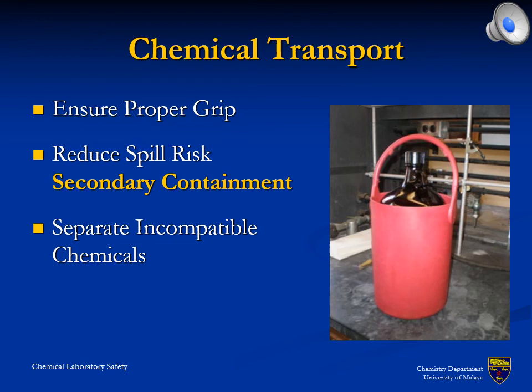Transport of chemicals requires the use of carriers with secondary containment. While chemicals may be combined for transport, separate carriers have to be used for incompatible chemicals.